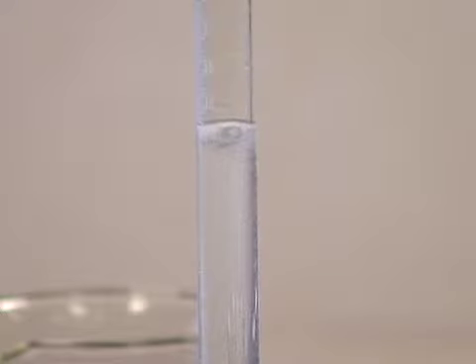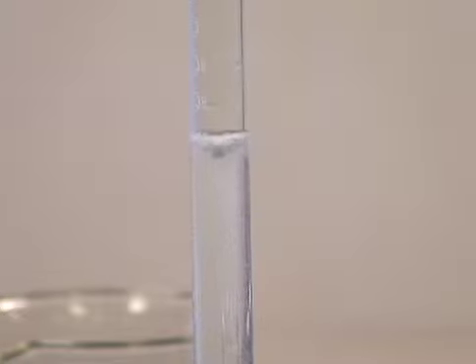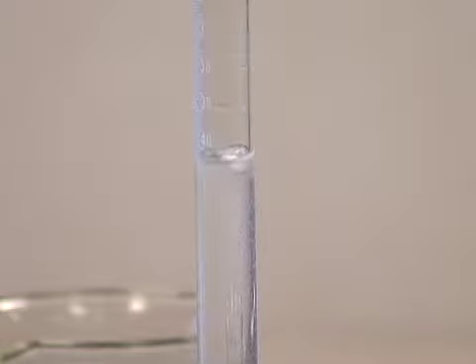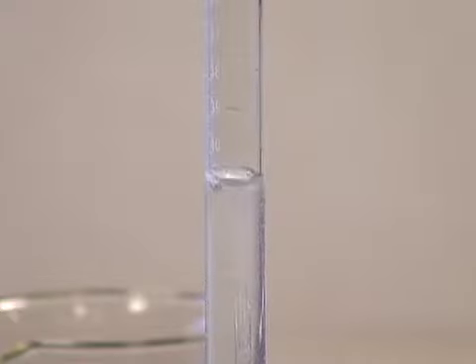And I can see that the volume is going down, down, down. I'm getting more and more of that hydrogen gas being collected here. Got a little bit ways to go here. I can see that piece of magnesium dancing around.